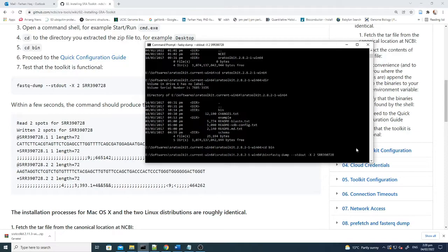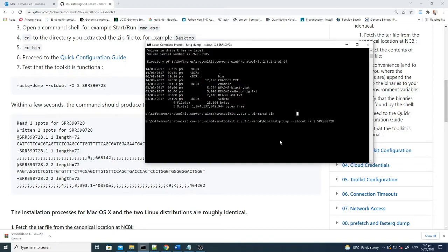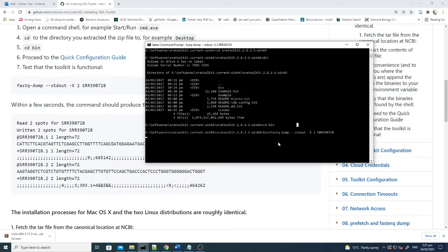The command should be shown here. It's not giving an error and it's actually running fine. This should give me the output. Let's wait for a while and I guess we will get the file.